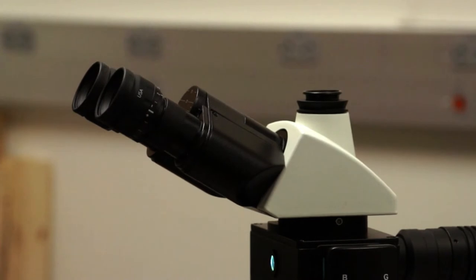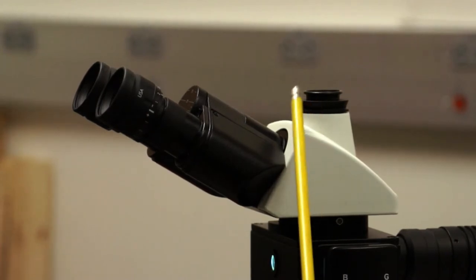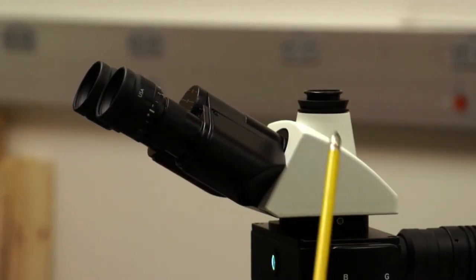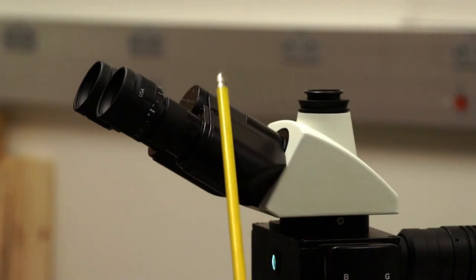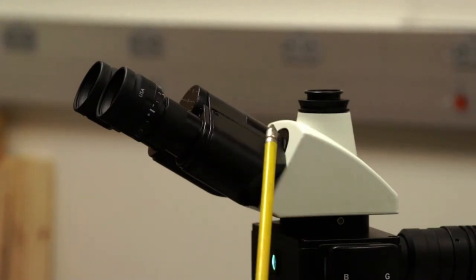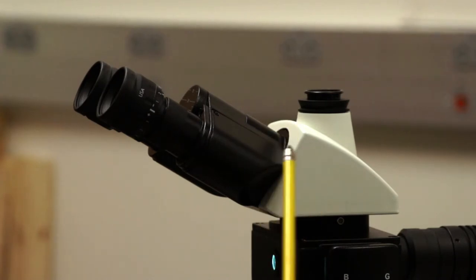Historically we've used film cameras on the trinocular port, but nowadays with the advent of digital microscopy, we can put digital still cameras on the microscope or also video cameras which record live motion in living cells. We also have binocular tubes and you may have seen monocular tubes in the past, but this one is called a binocular tube or head.